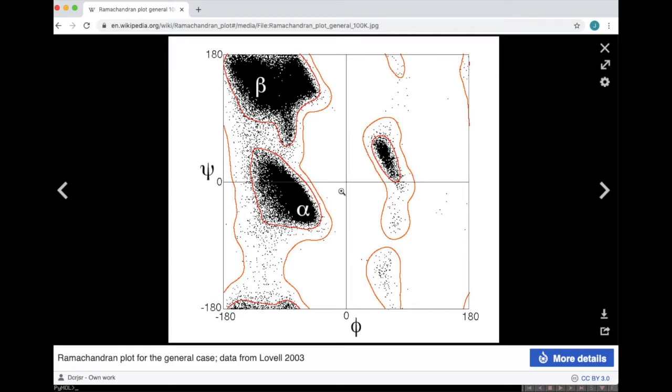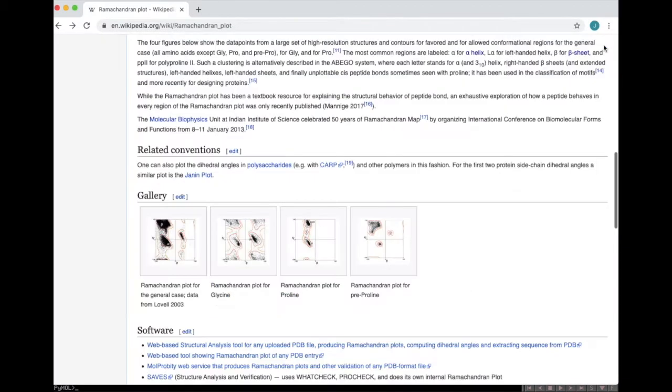Okay, so our hypothesis could be if the phi and the psi angles are 0 and 0, we will likely see some sort of clashing between atoms, causing repulsion or overlapping of van der Waals spheres, which suggests it wouldn't happen in nature. Okay, so that could be our hypothesis, and let's go and check that out.